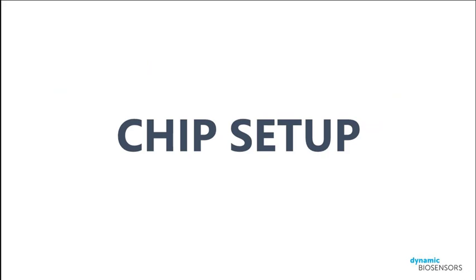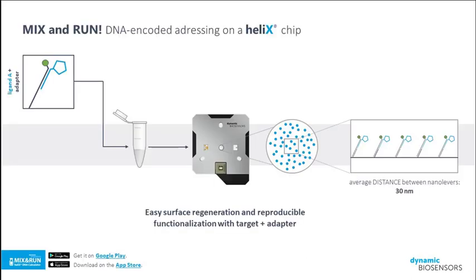So now that we have explored the readout very briefly, and of course we will get to that in further detail with the assistance of my colleague Stephanie, I would like to describe the workflow behind the empirical realization of these biosurfaces that actually enables us to run these various assays by controlling which targets are immobilized on the surface and which type of assay orientation we would like to use.